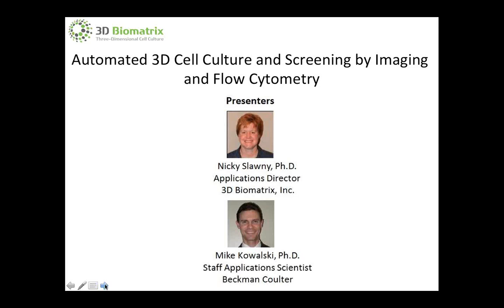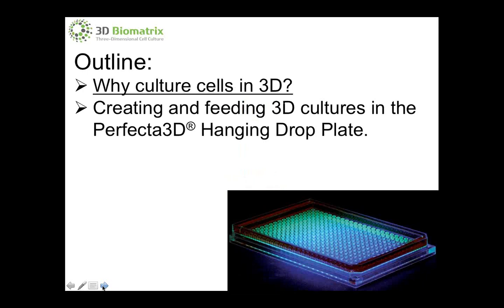Nikki will start the session by providing a brief overview of the hanging drop plate technology, and then we'll turn the session over to Mike. Go ahead, Nikki. Thank you, Marianne, for that very kind introduction. Today, as Marianne mentioned, I'll be covering why you might want to culture cells in 3D, and then creating and feeding 3D cell cultures in the Perfecta 3D hanging drop plate.